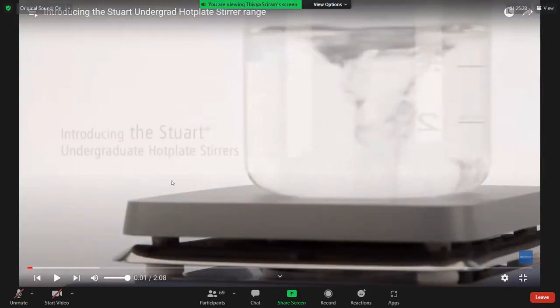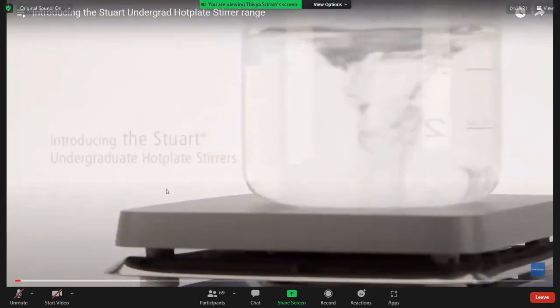Up to now, you have seen how to handle the autoclave. Now we will see how to use the magnetic stirrer.